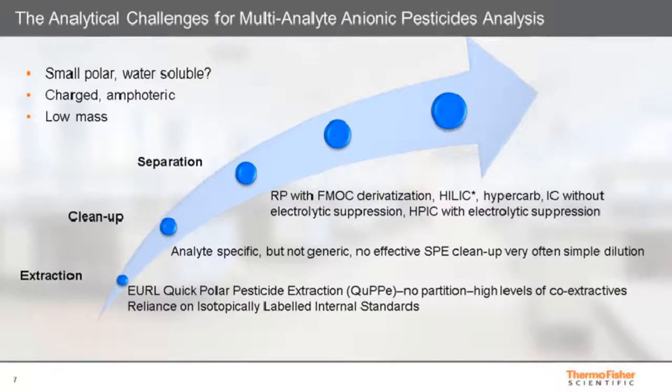It is also difficult to achieve sensitive, reproducible results using liquid chromatography with derivatization, or through direct analysis using HILIC or non-suppressed ion chromatography. The polarity of these analytes does not allow direct analysis by reverse phase HPLC. Some HILIC separations can suffer from metal contaminants that leach from conventional metal-based ultra-high performance liquid chromatography systems. Some vendors, for instance, recommend flushing the system with EDTA to minimize the interaction between analytes and metals.